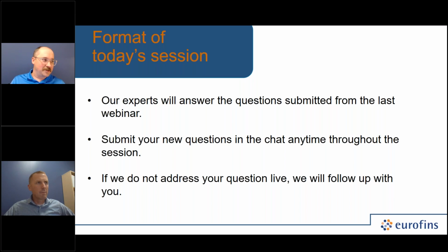So having data to support that is going to be critical, and it's not as easy as saying, apply this equation and you can take your AFU count and turn it into a CFU. And that's one of the big limitations with flow cytometry, and why we haven't seen it take off as much as you would think, based on all the other advantages we've seen.